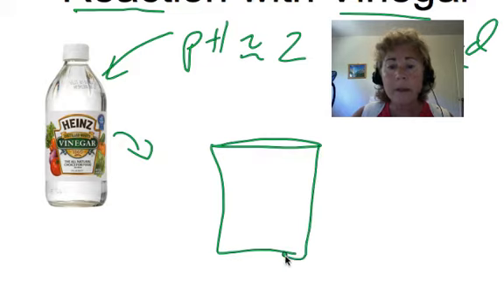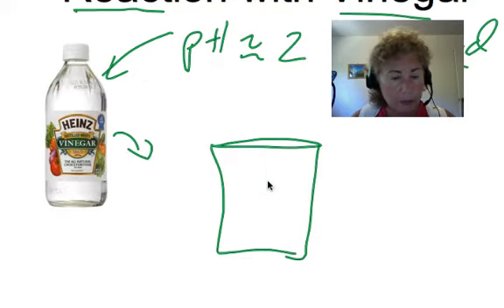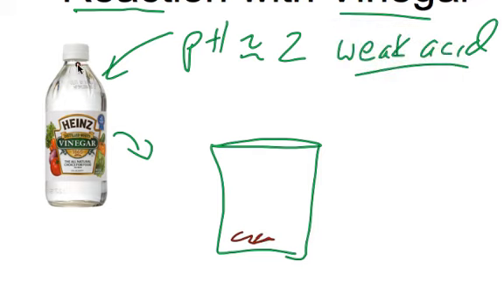Maybe we're going to add, let's say, I don't know, baking soda. So we're going to add some of the baking soda down there, and we're going to add 10 mils, I think, we're going to read our procedure, of the vinegar.